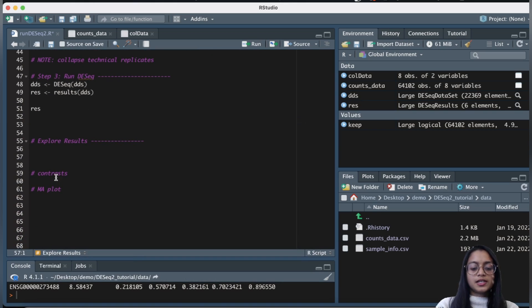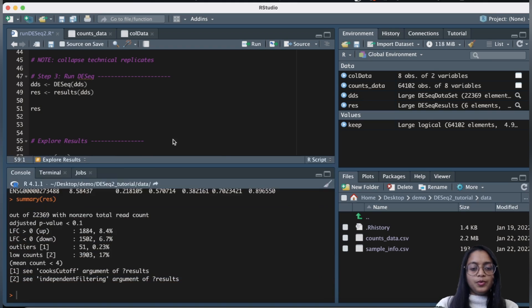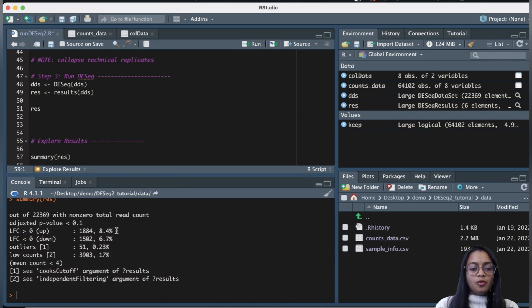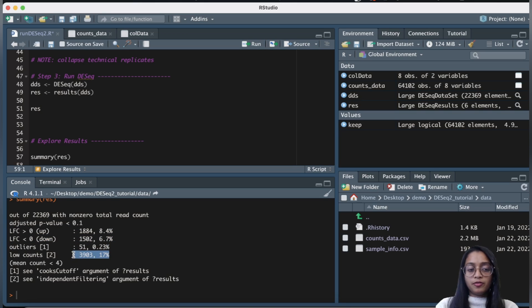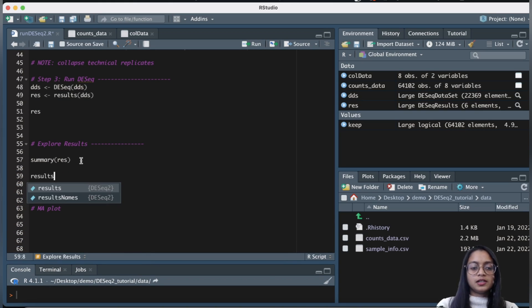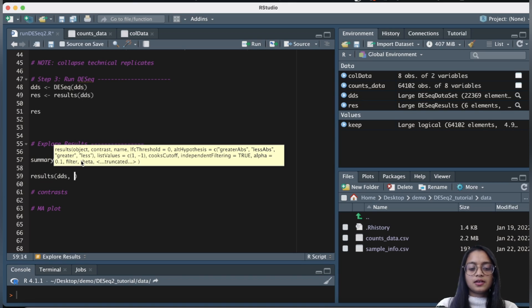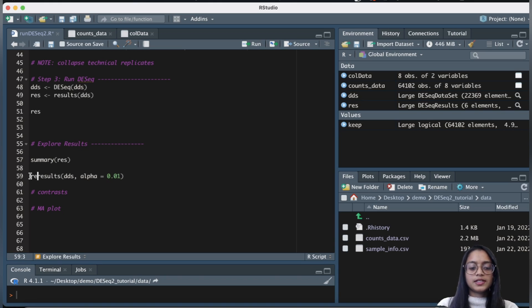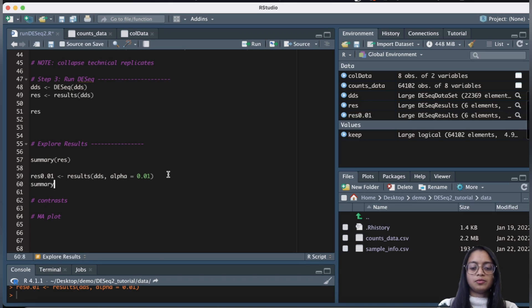Let's explore our results further by getting a summary. Running summary on res, we get how many genes are upregulated, how many are downregulated, how many are outliers, and how many have low counts. By default it uses an adjusted p-value threshold of less than 0.1. We can change this by passing alpha equal to 0.01 to the results function, saving this, and rerunning summary to see different counts of up- and downregulated genes at the stricter threshold.